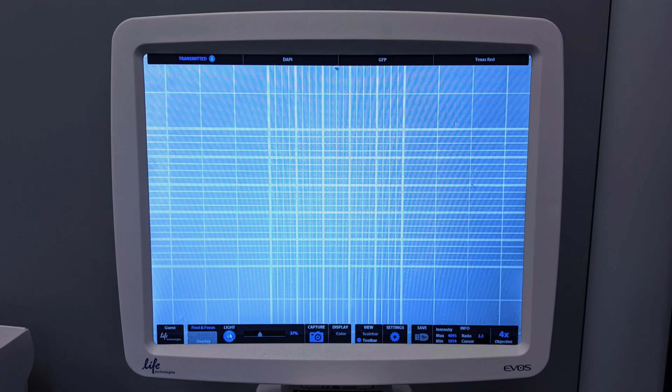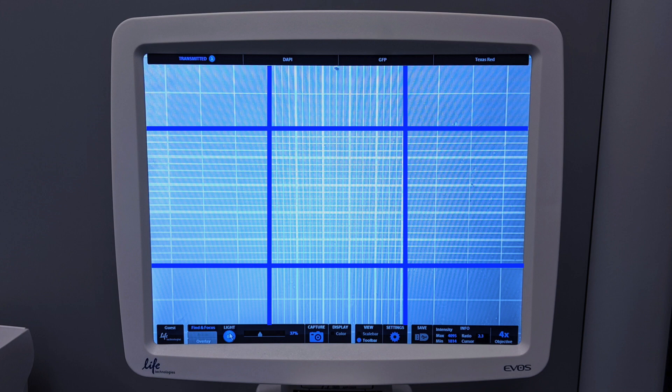The hemocytometer chamber is made up of nine equally sized squares arranged in a three-by-three pattern.